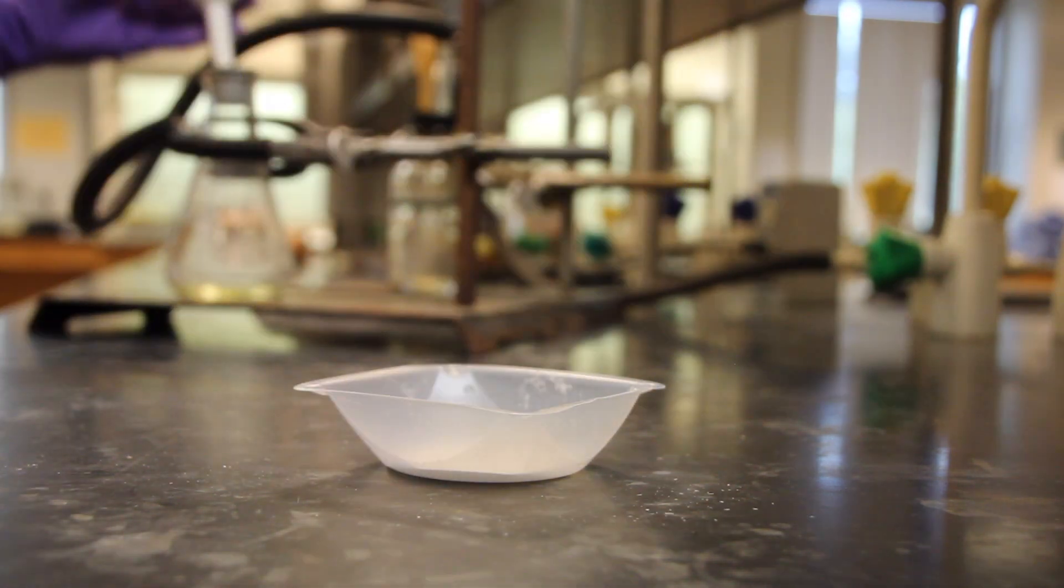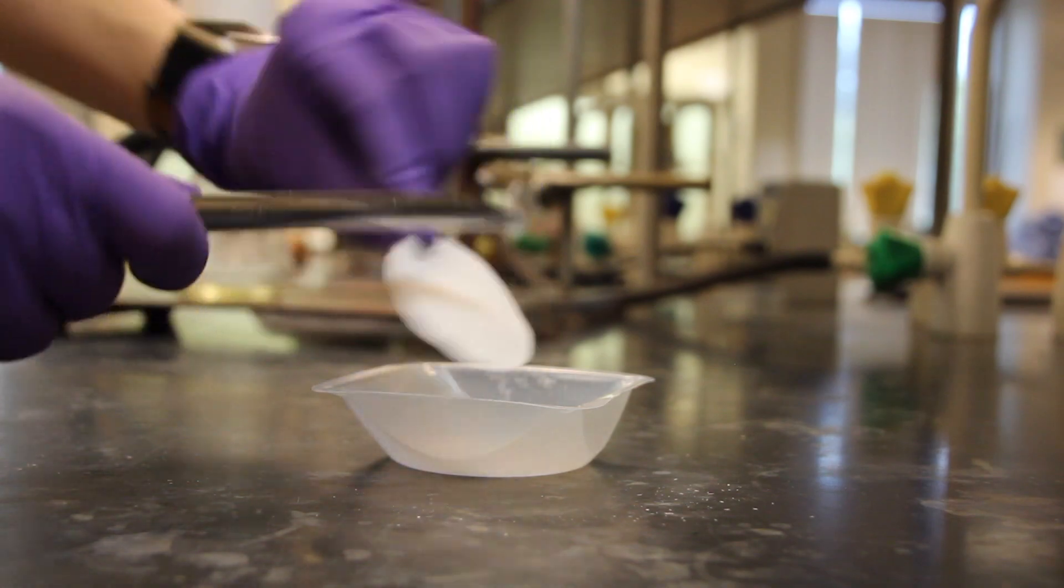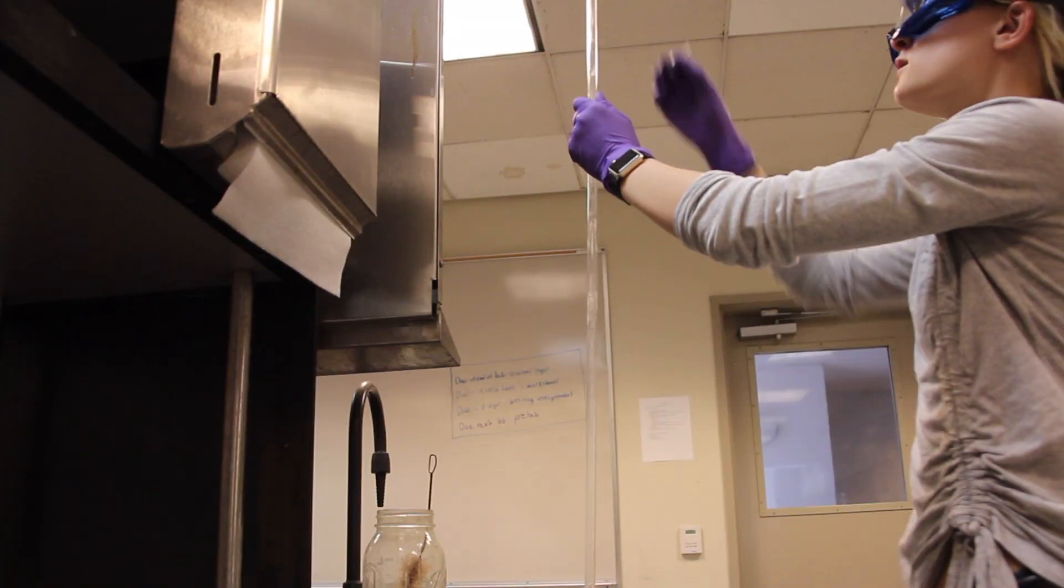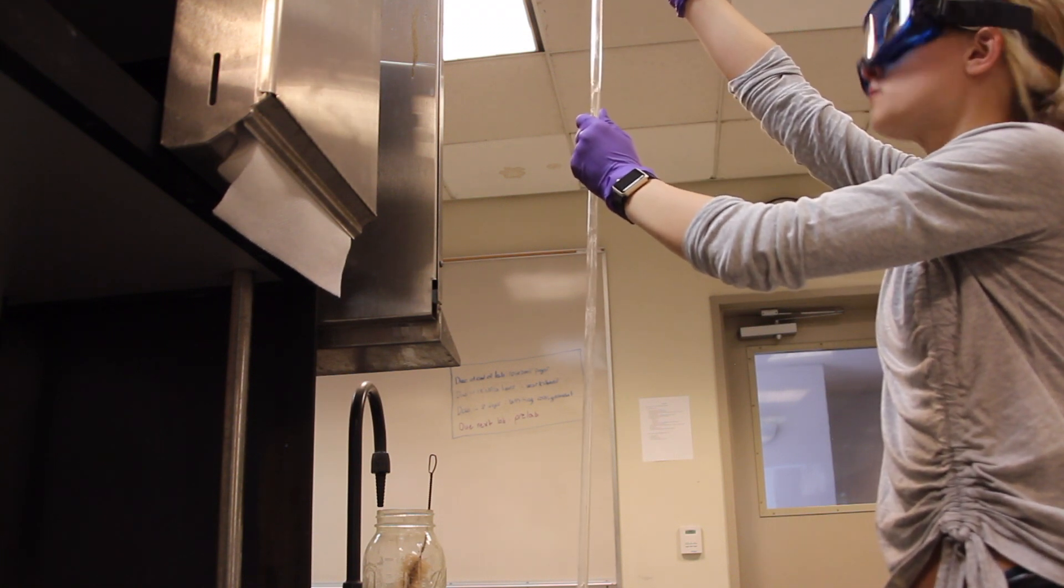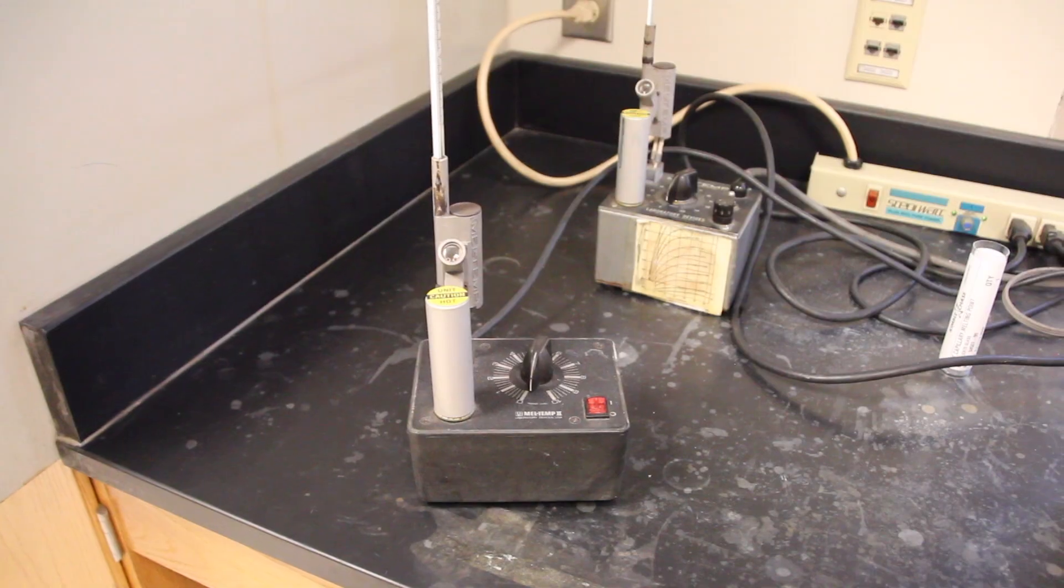To obtain a melting point for your recrystallized product, begin by preparing a sample in a capillary tube. A melting point apparatus can then be used to visualize the melting point of the product.